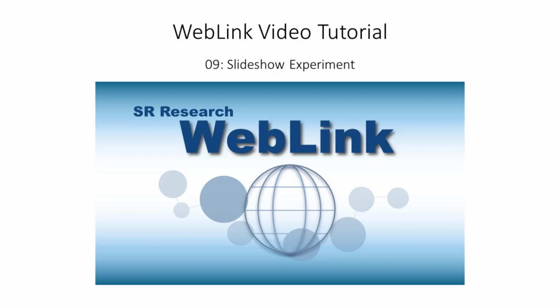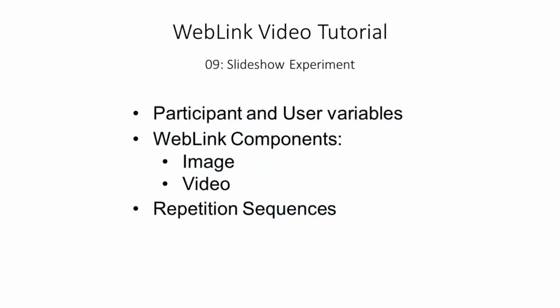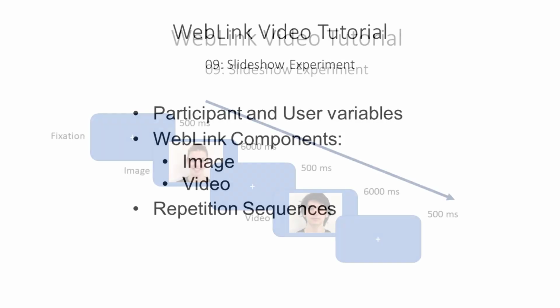Welcome. In this video tutorial we will use WebLink to create a simple slideshow style experiment in which participants view a series of images and videos for fixed durations. The tutorial covers use of participant and user variables as well as use of WebLink's image and video components. It also demonstrates the use of repetition sequences. At the end of the tutorial we will take a quick look at the gaze recordings in Data Viewer.